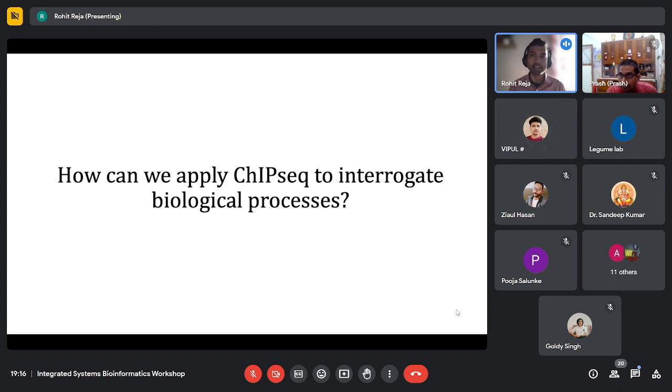It doesn't matter what genome it is. If you have a very well annotated system where you know exactly what genes there are, a majority of these tools like motif analysis and gene ontology analysis are developed more for mammalian systems. So you might have some struggles there because you're trying to find out what genes this transcription factor is binding, but you can't because those genes are not annotated. We don't know what those do in plant systems. We have never seen those motifs, so it will be very interesting, I would definitely say.